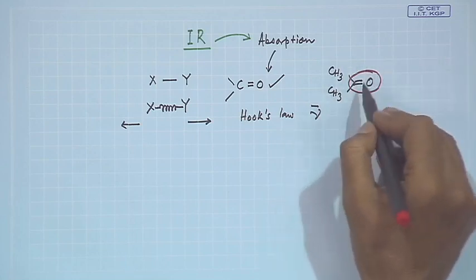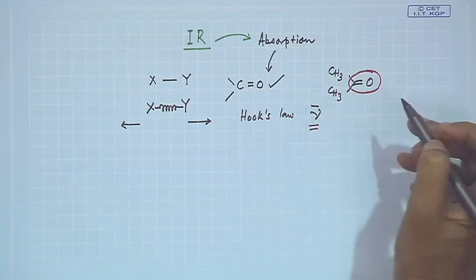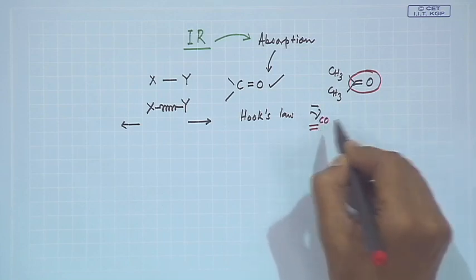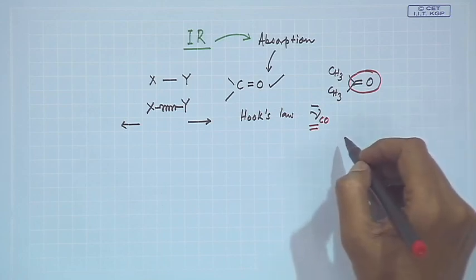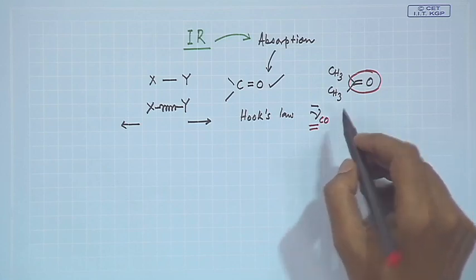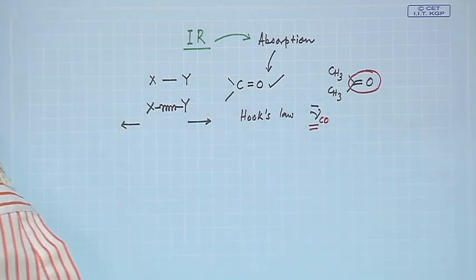So, this acetone solvent can give you the corresponding characteristic stretching frequency in terms of the corresponding absorbance values, and we call it the stretching frequency for the carbonyl function, because the carbonyl is a very unique one for all the different molecular species, like different organic molecules, where this particular stretching is present.